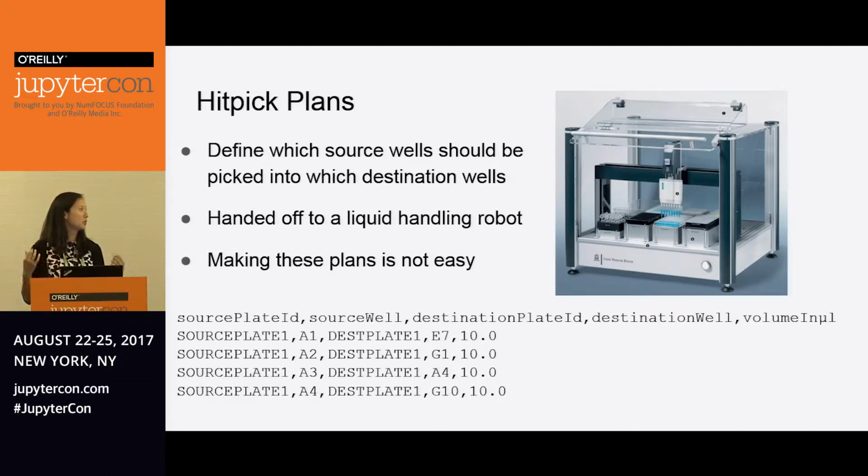And this makes our lives way easier because pipetting, as you saw, is a very manual process. It's very error prone, and it's nice to have these machines that you can tell, okay, move these liquids from this plate to this plate and do the work for me. And I was really excited when I saw these at Zymergen because my background is in biology, and when I did biology in undergrad, I had never seen one of these before.